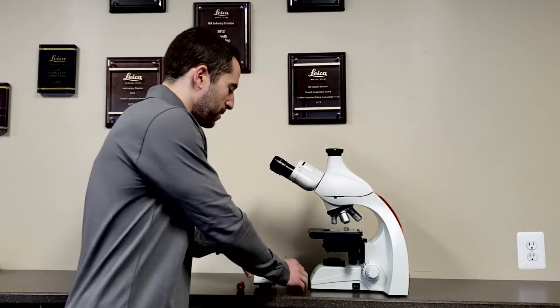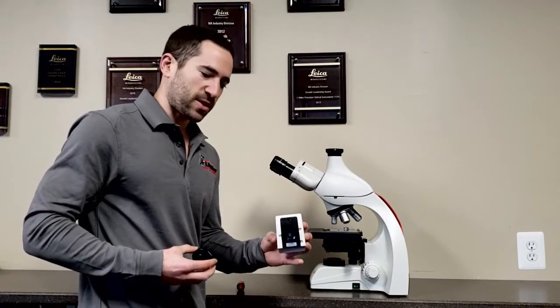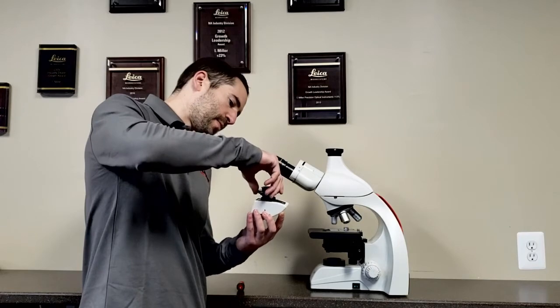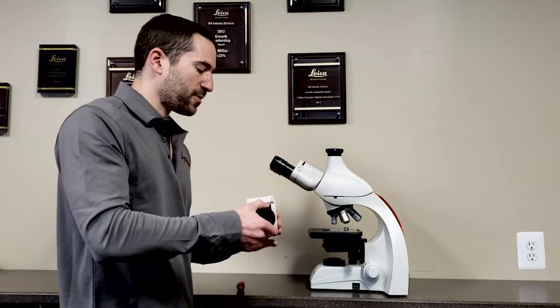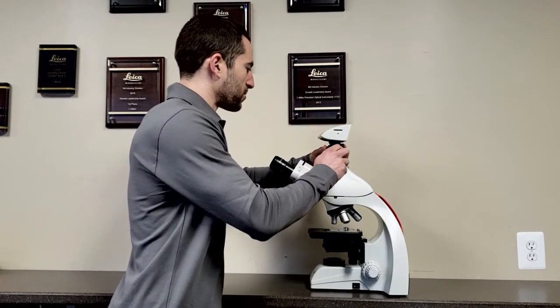The C-mount adapter allows the camera to secure to the microscope. The first step is to take your threaded portion of your C-mount and screw it into your microscope camera. After you do so, you simply mount the C-mount on top of the microscope and tighten the locking screw.